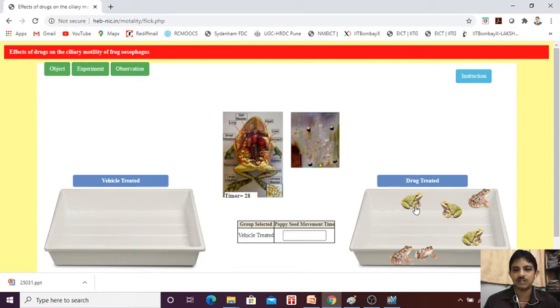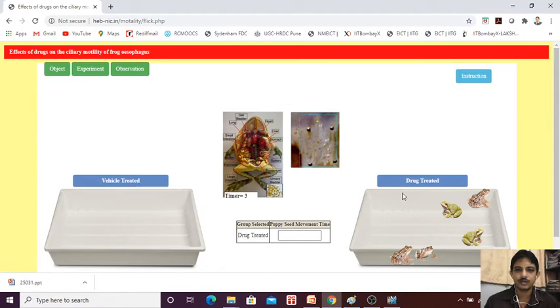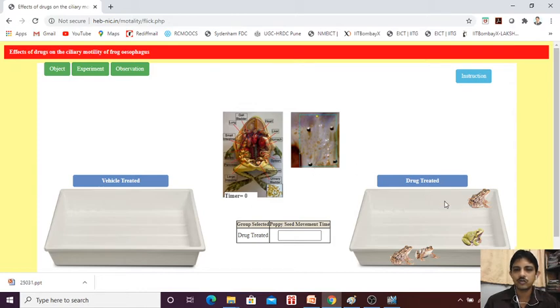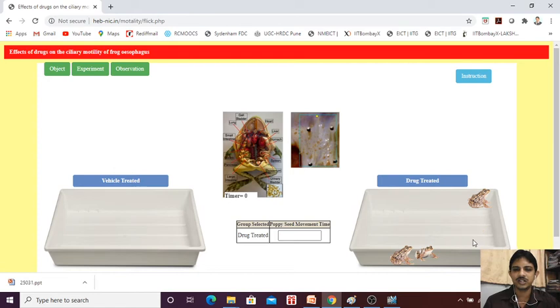Now, in the case of the drug treated, what we can find is that in the last time it was reached. Again, one more — so in the last time only 10 to 12, 13, 14 or 15 to 16 seconds, it was reached.